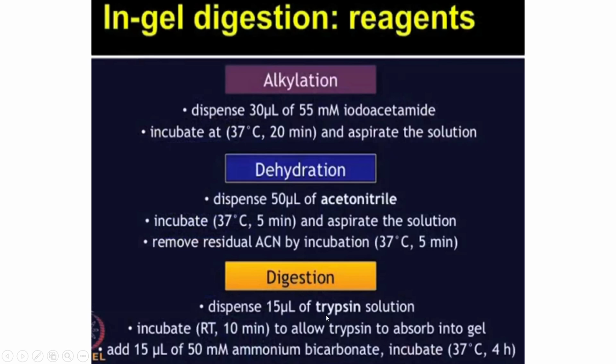Then you will do the trypsin digestion. You will add trypsin, and whatever proteins are present will be digested at arginine and lysine residues.